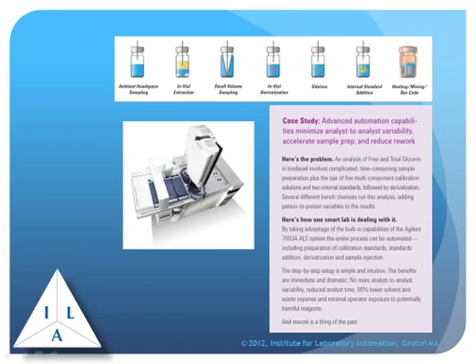Another example of robotics is put out by Agilent. It may not look much like a robot. Basically it is a very sophisticated autosampler. And the autosampler, instead of just taking a vial and introducing it into the chromatograph, has the capabilities that are shown at the top of the screen. You can dissolve a sample, you can dilute it, you can add internal standards, you can heat it, mix it, a whole bunch of things.